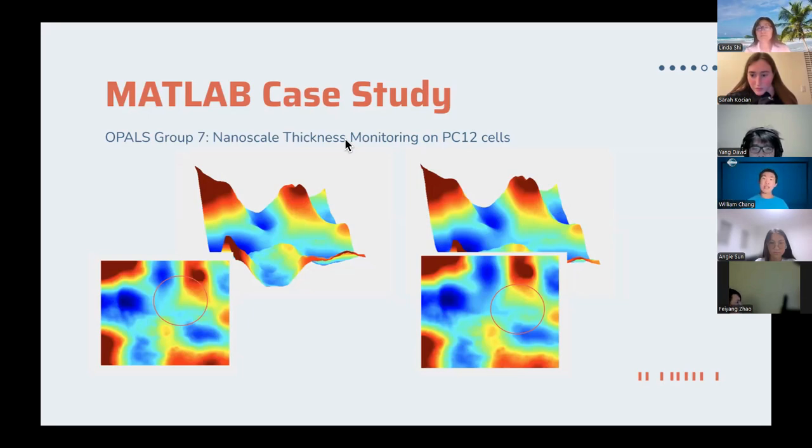The way they did this was that they laser ablated the PC12 cells. What that means is that they're basically using very high power lasers and slicing these cells so that these cells experience damage, and thus the cells might have some molecular mechanism to facilitate repair and modify their thickness based on the varying strengths of the lasers.